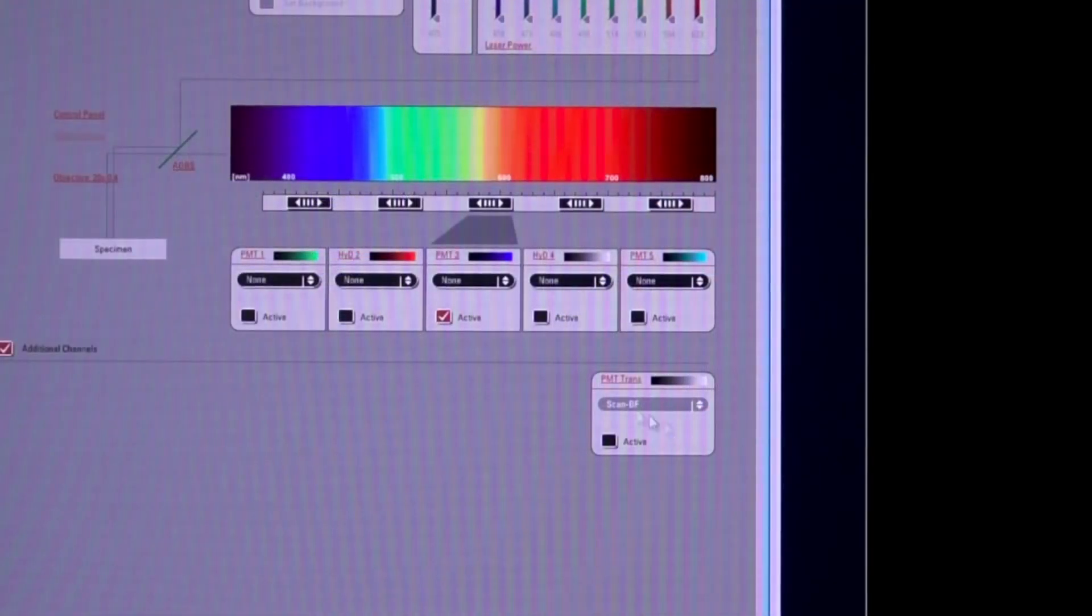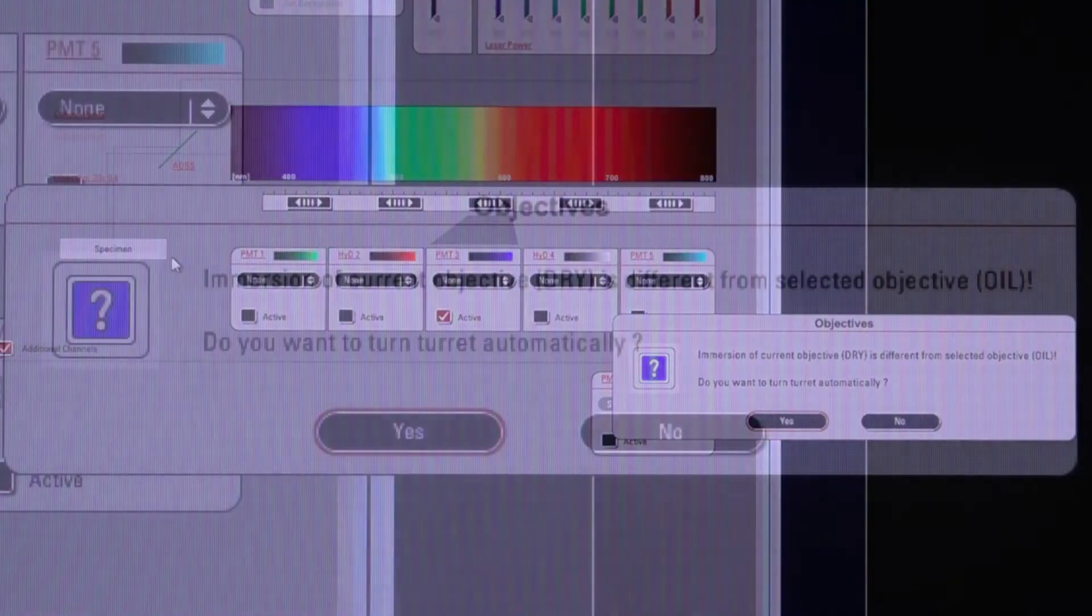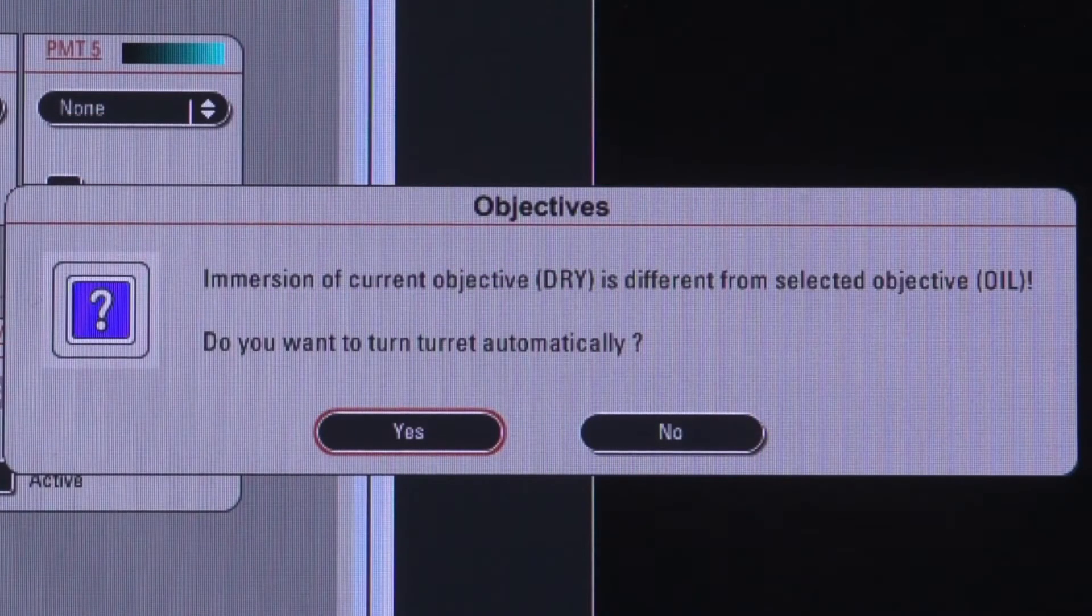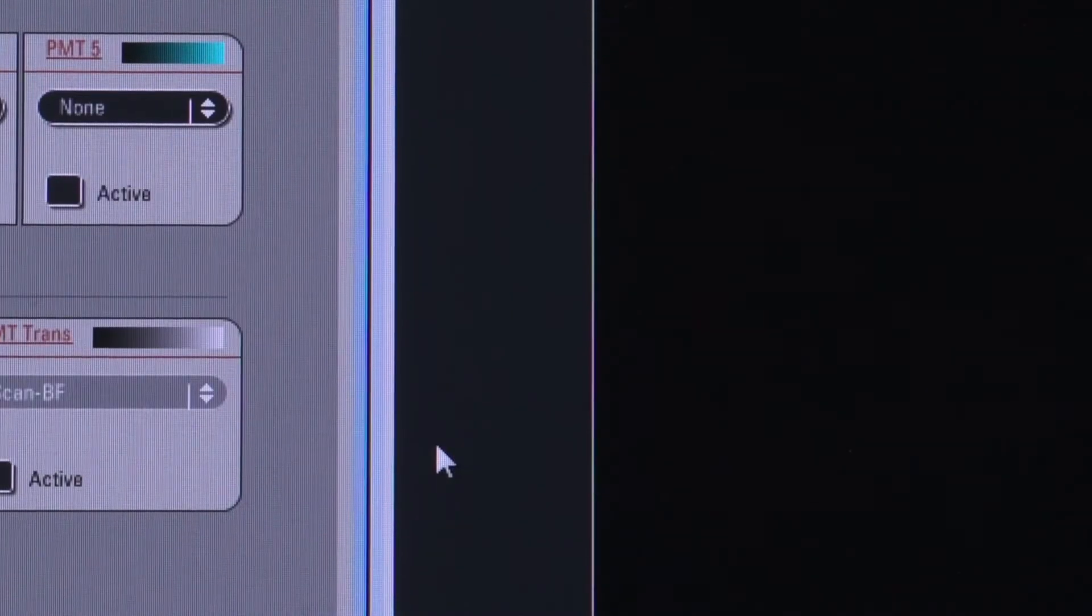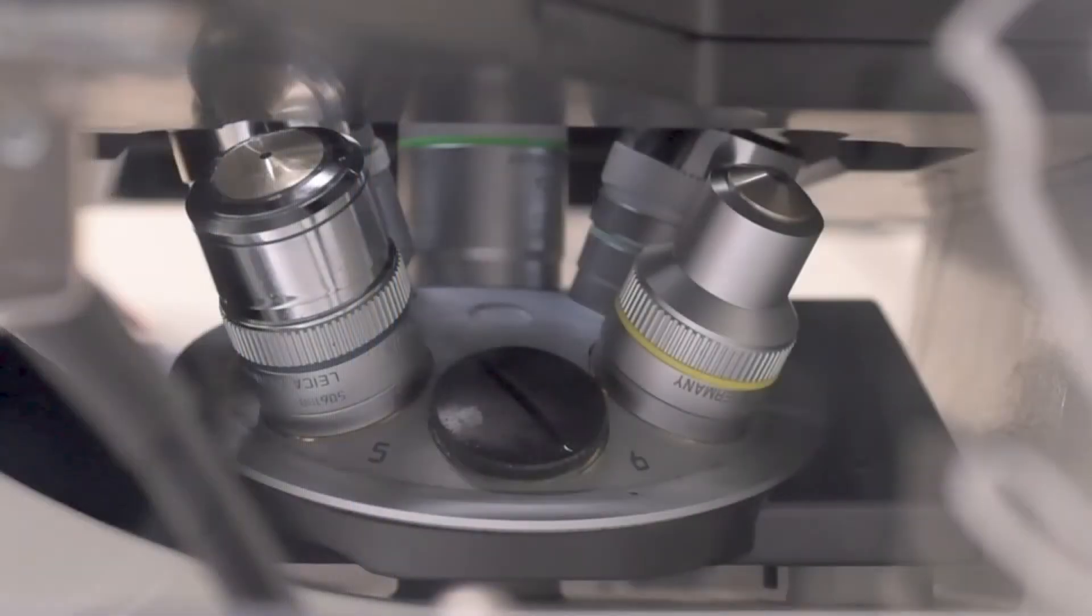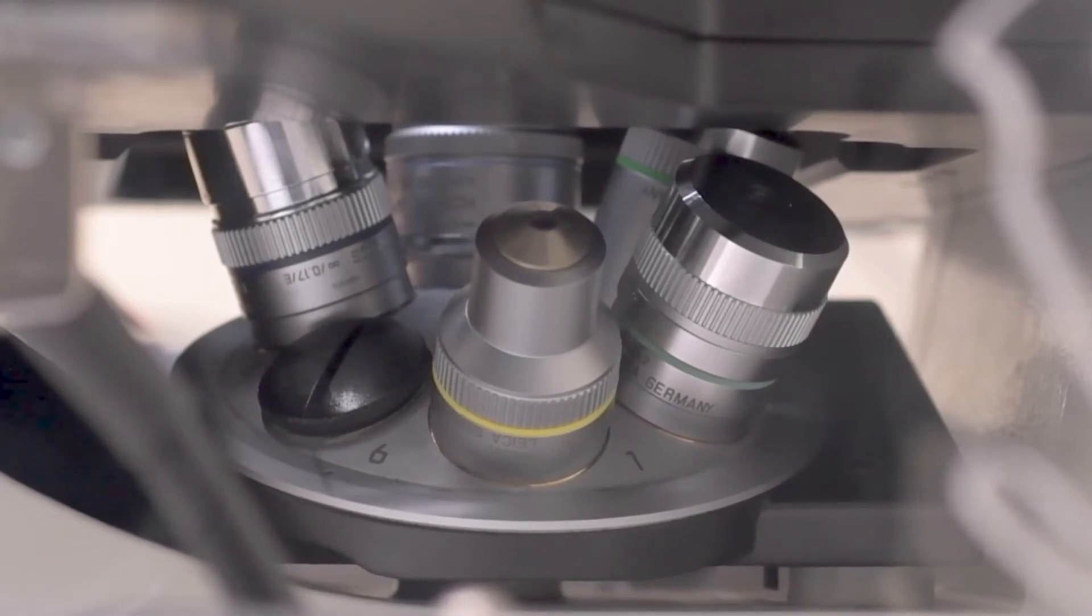The confocal knows this. So when we click on the 40X oil lens, we are switching between a dry objective and an immersion one. The software now pauses and asks if we really want to do that. Just click on yes and the lens will rotate. Looking from the side, notice that when the scope switches between objectives, the lens retracts, rotates to the new one, and then returns back to the Z position it was at when it started. This is helpful when going from one oil lens to another, like the 40 to the 63X.